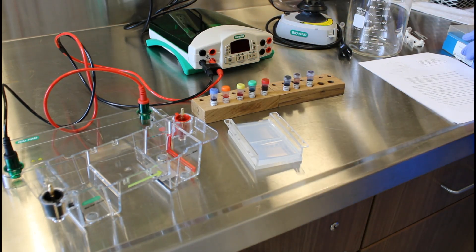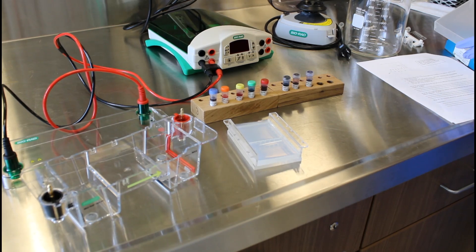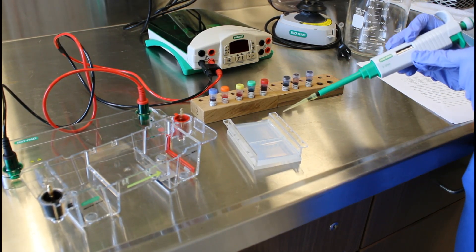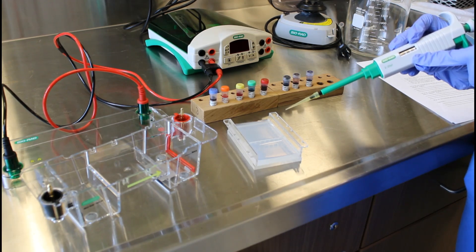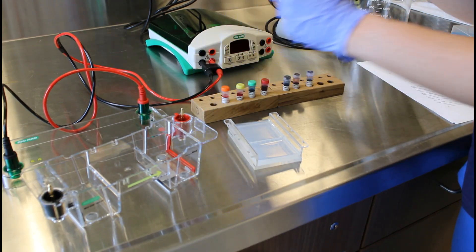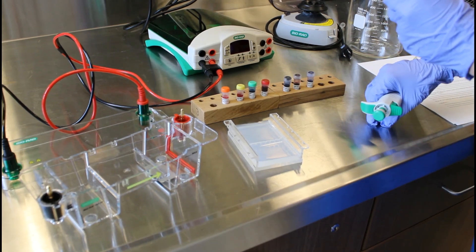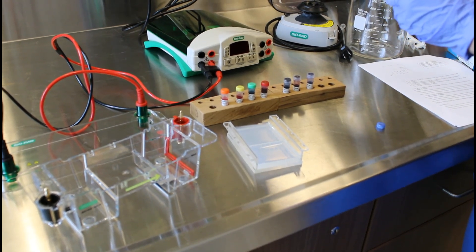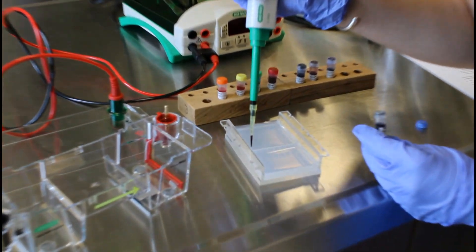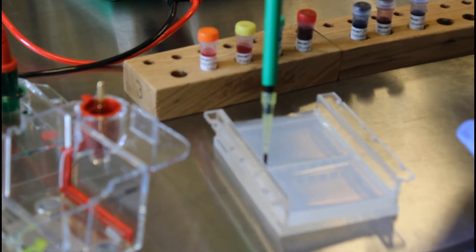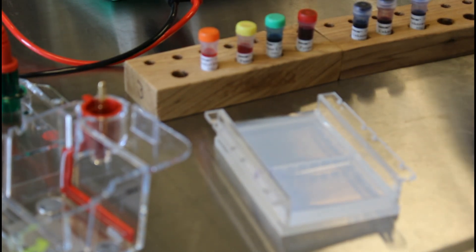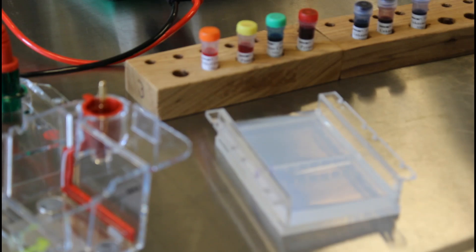I'm going to use a micropipetter. It's already set to 20 microliters and I'm going to use this to pipette 20 microliters of each of these substances into the gel. So starting with this bromphenol blue, I'm going to get that in there and then I'm going to throw away this tip so that I don't contaminate my next well with that dye.